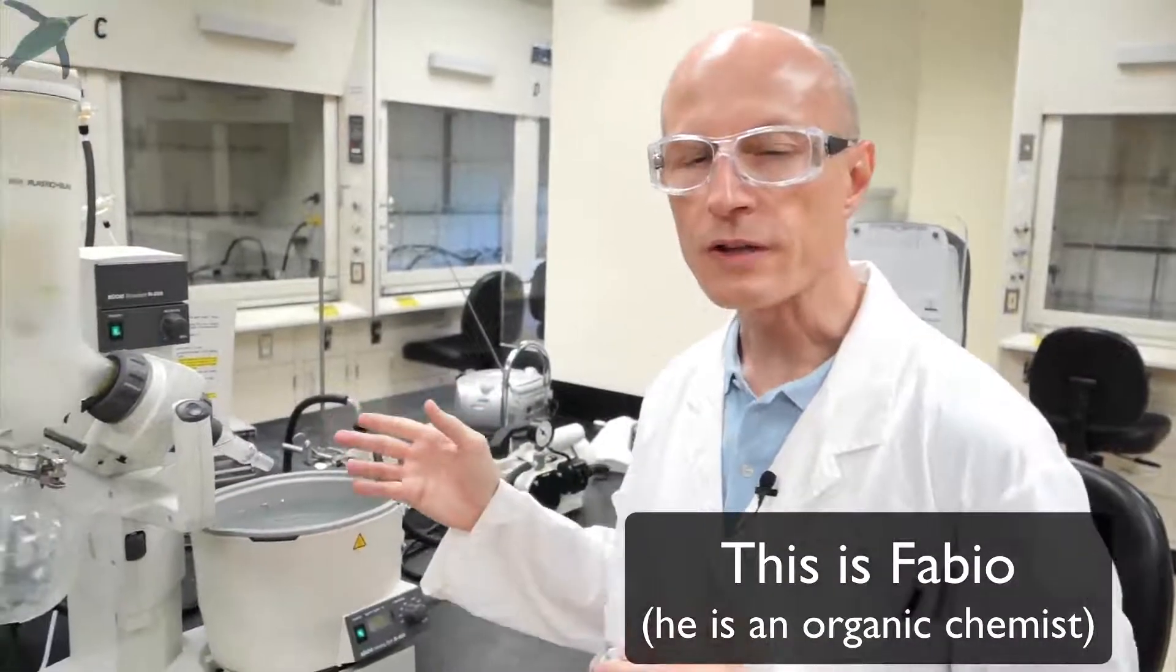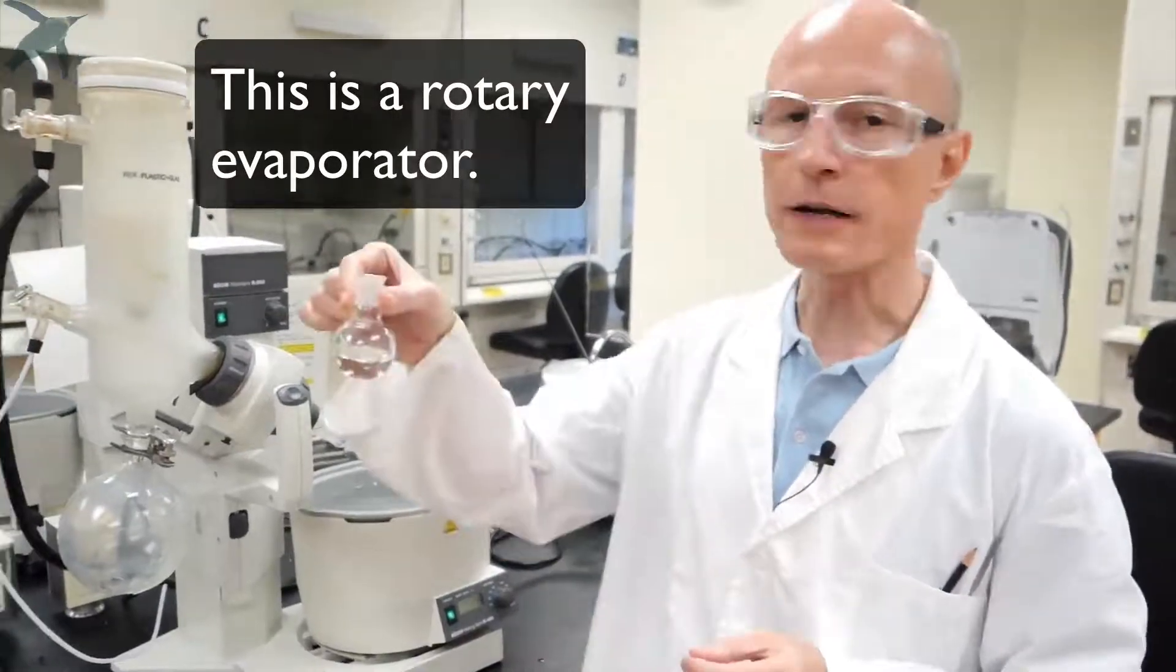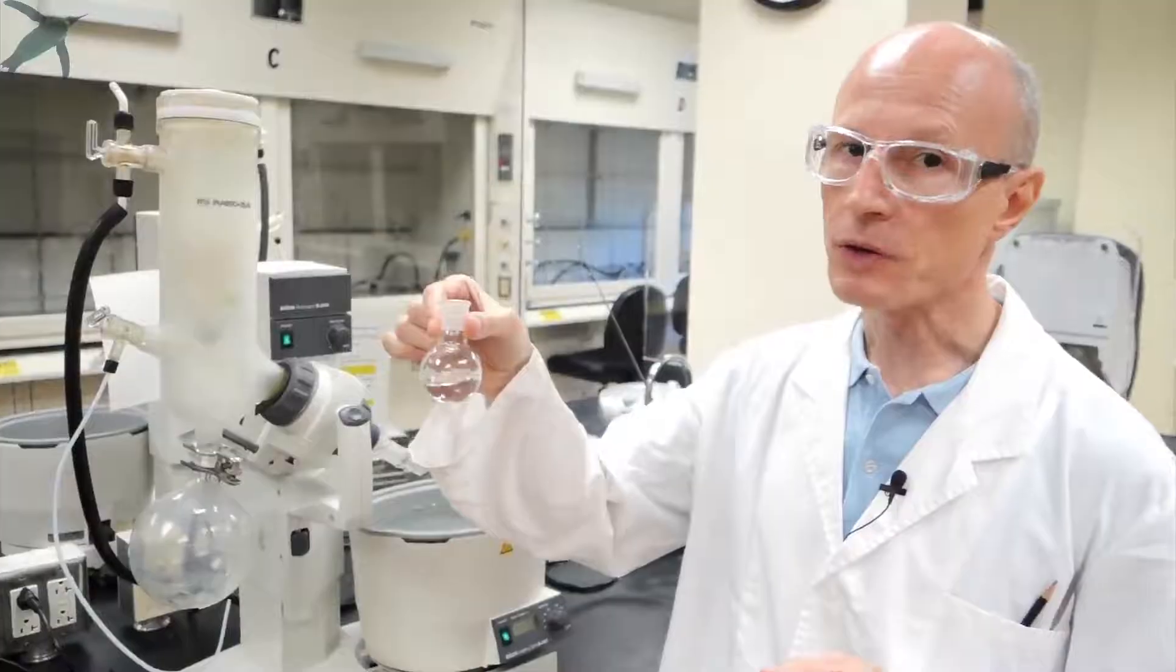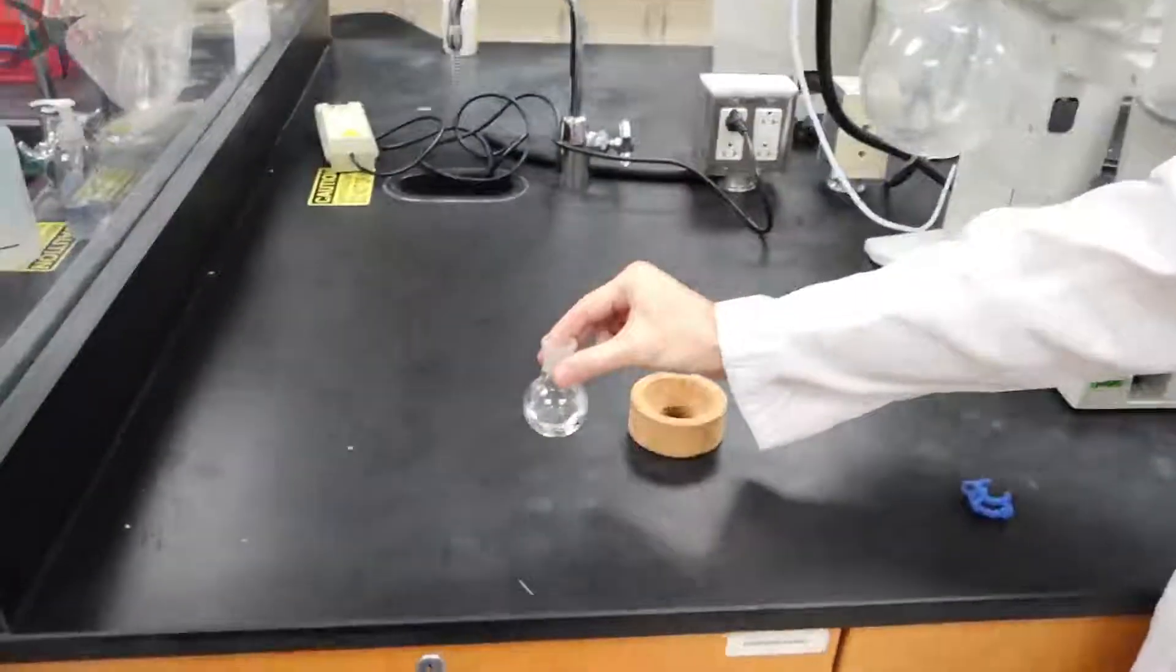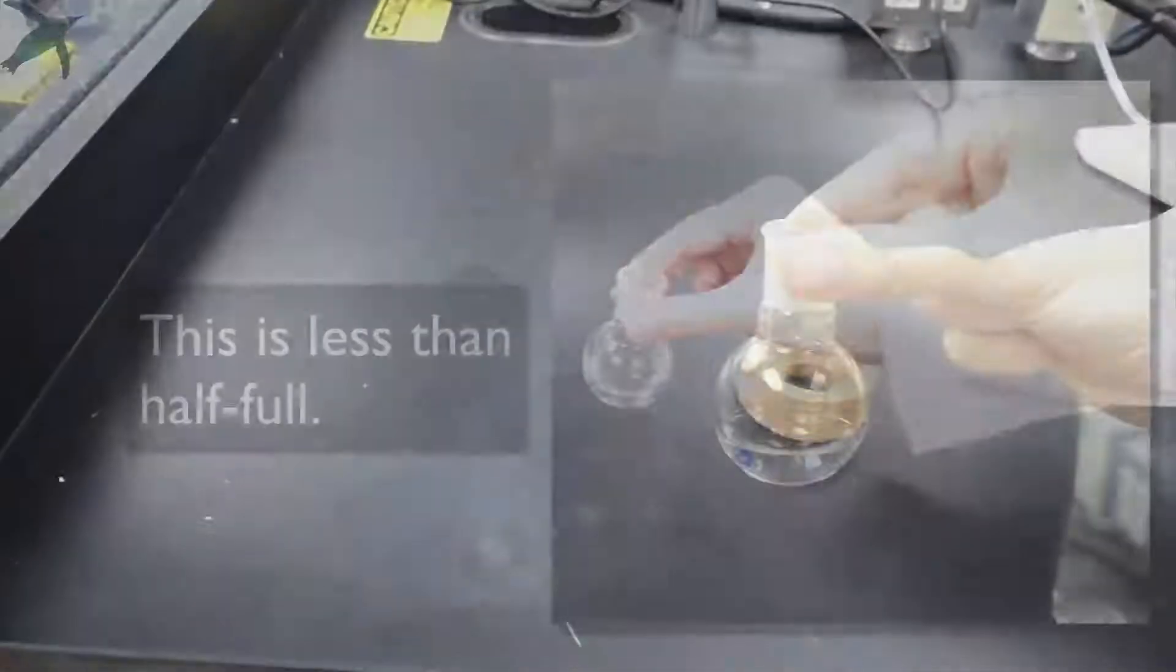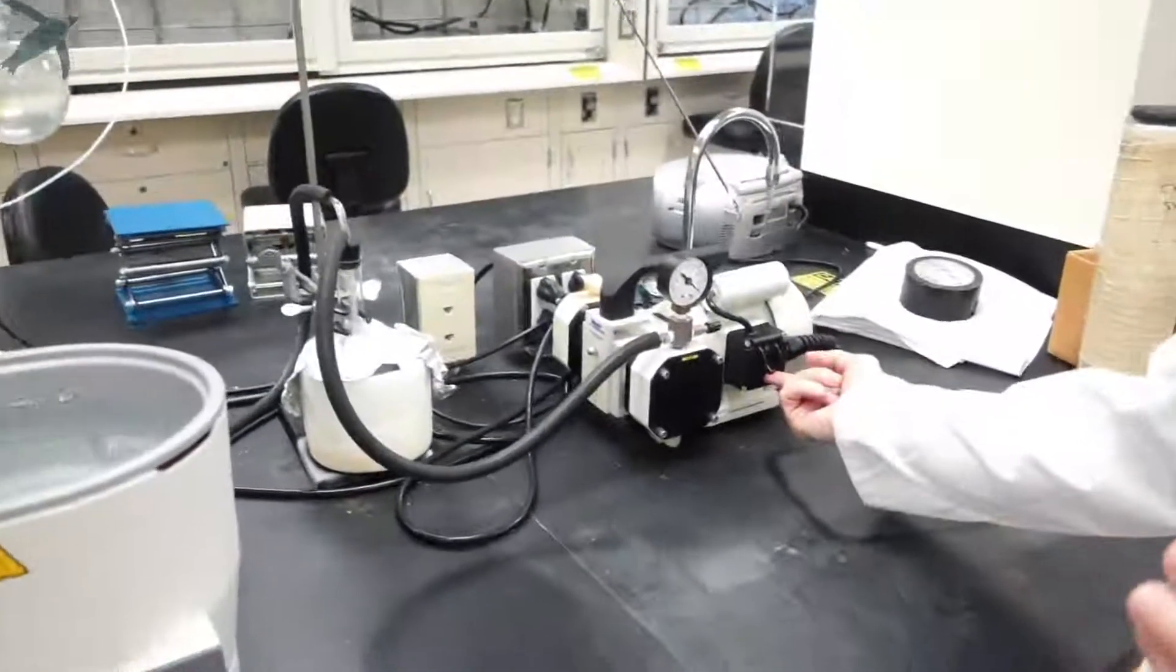The Rotary Evaporator or Rotavap is used to remove organic solvents from solutions that are in a round bottom flask. Before you use the Rotavapor, make sure that your round bottom flask is less than half full and that the vacuum pump is on.